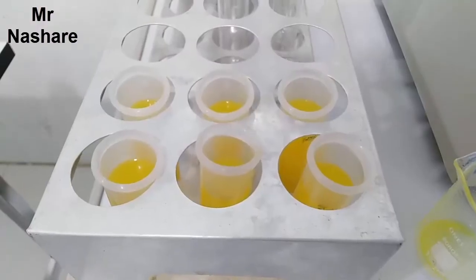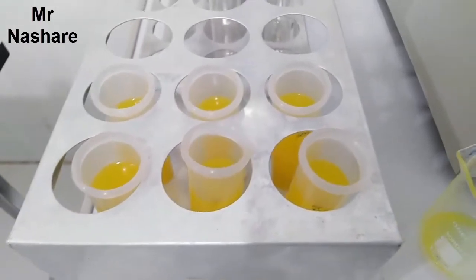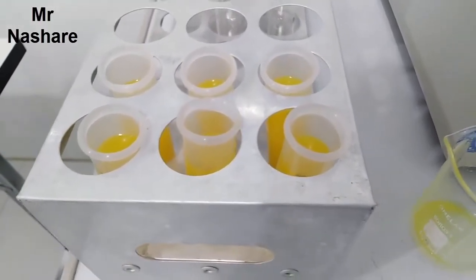And finally we have 6 tubes filled, and I will take them to this machine to practice and submit to the device.